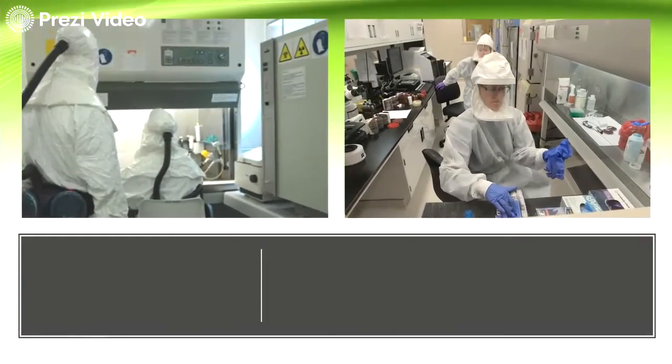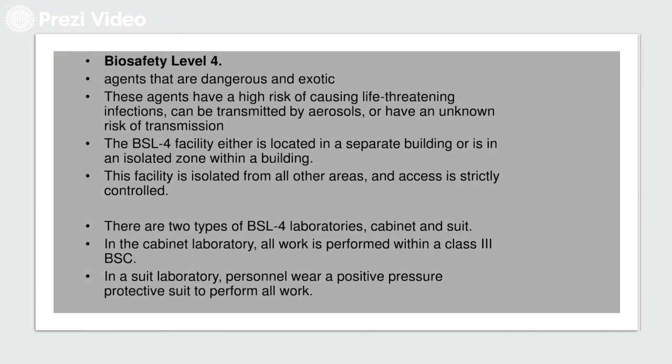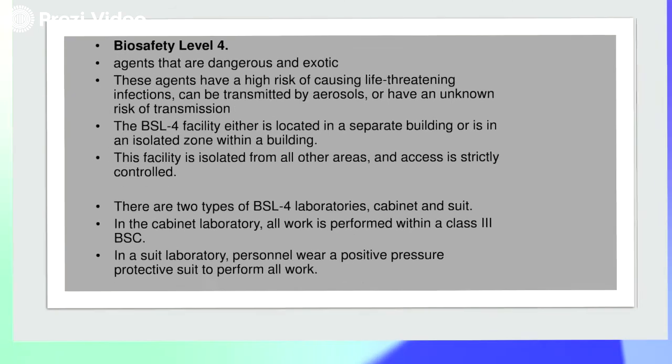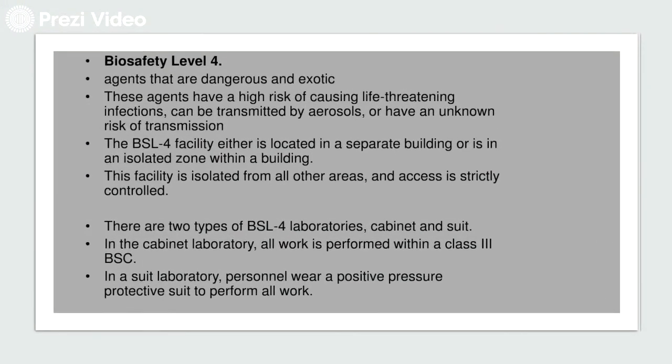So, class 3 biosafety cabinet ang ginagamit dyan. And then, in a suit laboratory, personnel wear a positive pressure protective suit to perform all work. So, ito yung mga positive pressure protective suit. So, as you can see, meron siyang respirator na nakakabit sa kanya. So, yung air sa loob niya, controlled. Diba? Nakakahinga siya.